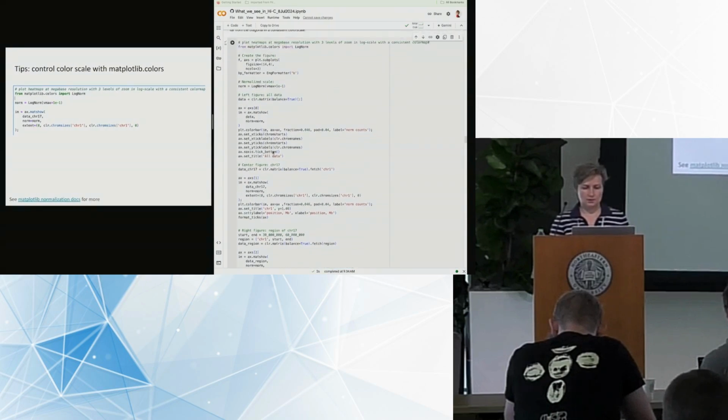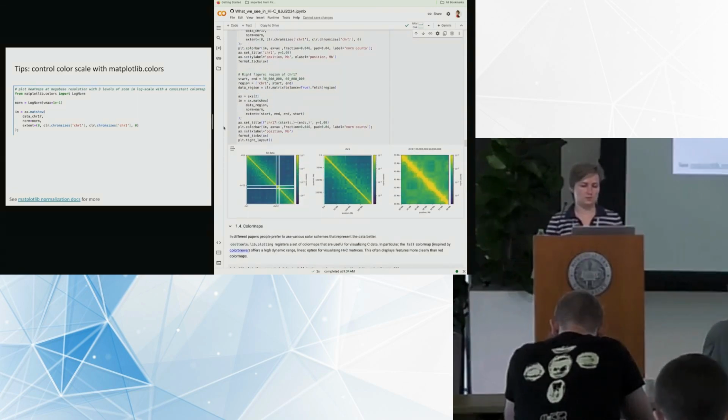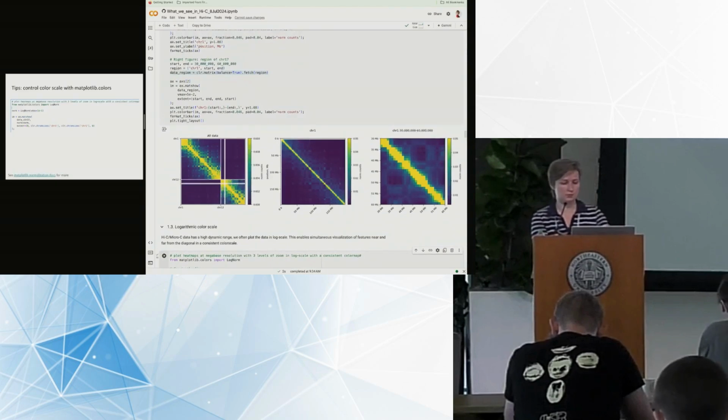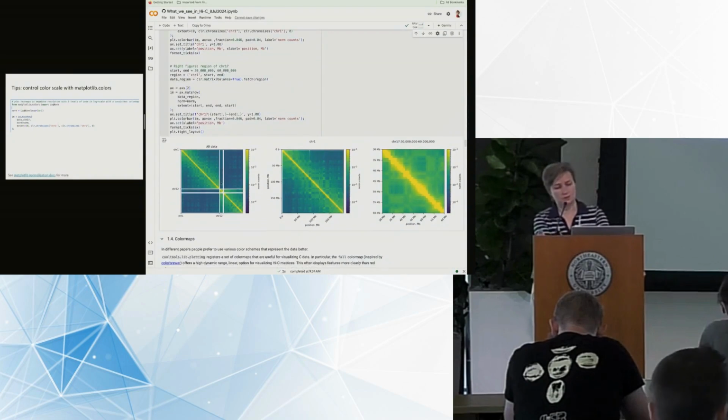So basically, as you can see, in my case, I set up the maximum of my logarithmic scale to 0.1, and it's nicely reflected in the views with Hi-C matrices. And you can appreciate how much the view has changed, because in the previous view, I was mostly able to see the main diagonal. And in the logarithmic scale, I'm now able to distinguish different interactions between compartments, both within chromosome and in between chromosomes.